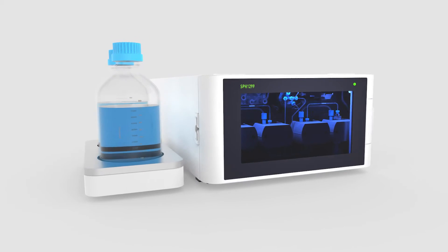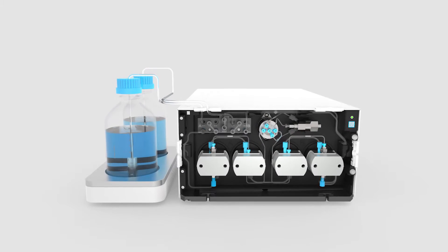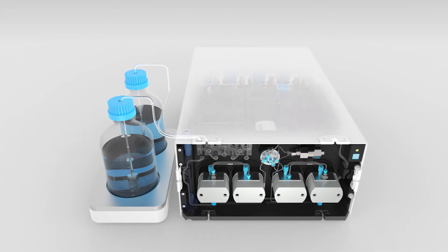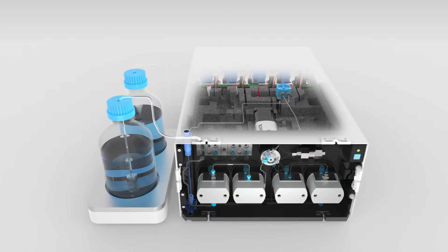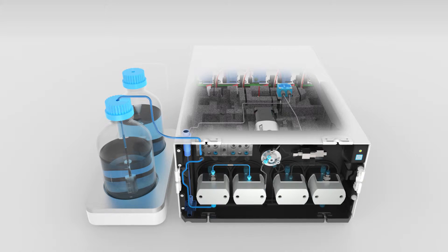Good pumping starts with proper priming. Traditional pumps need a syringe to assist priming the pump head. The SPH 1299 is truly automatic self-priming — no need to assist. A built-in prime pump aspirates solvent all the way through the pump heads into waste.